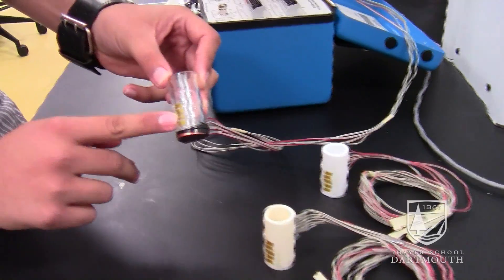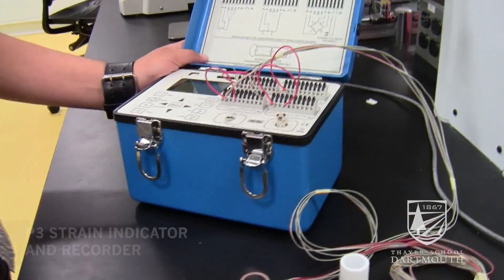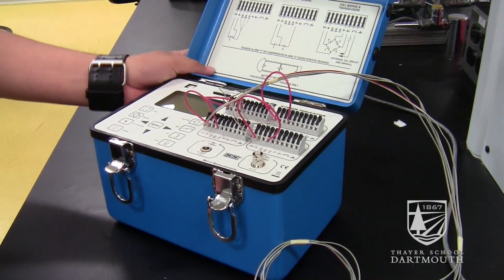Here are the strain gauges we use to measure the strain along the mold. We use a P3 strain indicator and recorder to measure four different channels.